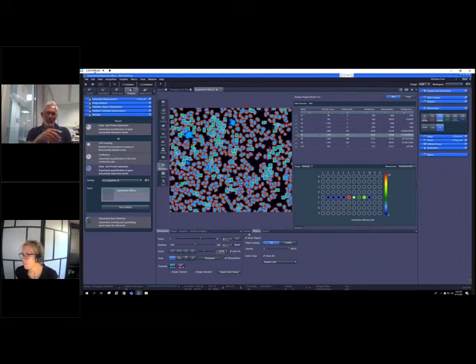After a couple seconds, it's illuminating a sample from very different points of view, never in the direct way. And this makes things available like translucent samples, which you will never see in any kind of transmitted light or reflected light contrast. So dark field helps a lot. And I guess the basic idea behind this was to give us access to any kind of sample, whether staining or no staining.